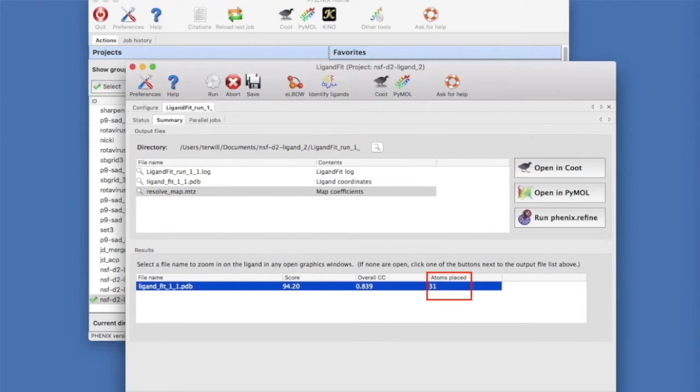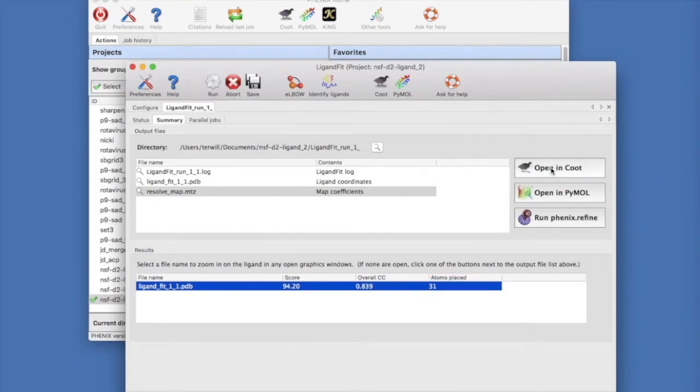A good map correlation is 0.75 or higher. Below 0.5 is often suspect. If not all the atoms in your ligand are placed, it means that there was no density for some parts of the ligand. Let's select this solution and click Open in Coot.